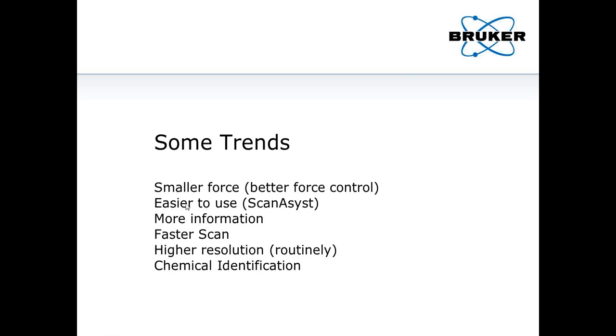And the other thread is how to make this machine easier to use. That one I didn't talk much about, but for PeakForce Tapping mode, we have ScanAsyst, a built-in algorithm to optimize the force, how much force to apply, how fast you scan, and the feedback speed, so that without too much intervention from the user, you can get a very good, decent image.